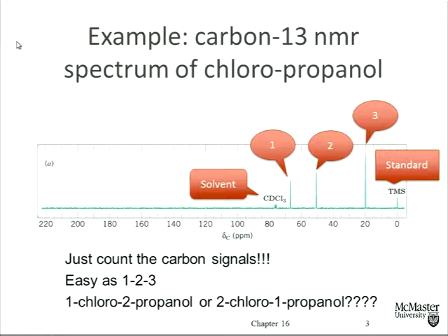So we have a standard compound in there, and it's important to recognize that, because if I give you a real-world carbon-13 NMR spectrum to interpret, it may well have that signal at 0, TMS. That's not part of our unknown compound. If I had a penny for every time a student sees a signal at 0, goes to the table that tells you what sort of carbons come at 0 ppm, and it says carbons attached to silicon, everybody starts to try to solve a structure that's got silicon in it.